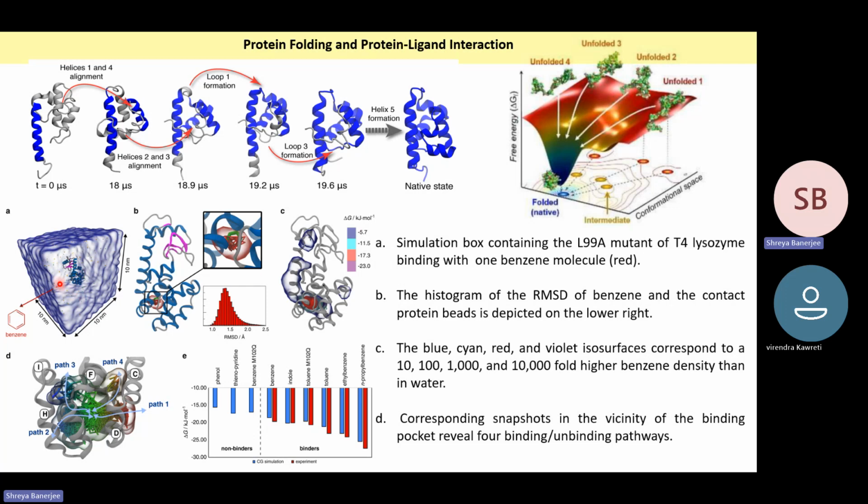So whenever additional interactions are forming, like between benzene and protein, they can be calculated and mapped. You can see here there is a blue envelope, and blue is a relatively weak binding energy of minus 5.7. Rather than that, the strongest binding is happening here, where there is a red envelope. That is the binding pocket.